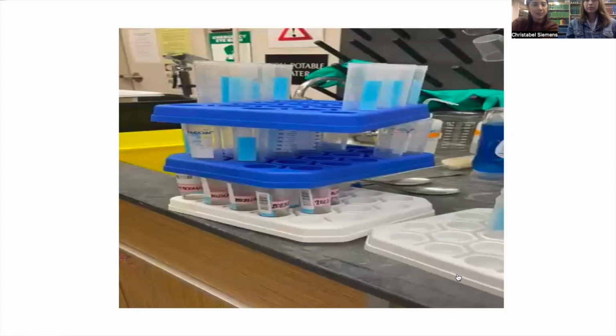And then this last video right here shows the vials separated and just the station of one of the tests that the soil samples go through. And as you can see, they all already have their own unique barcode, which identifies them.